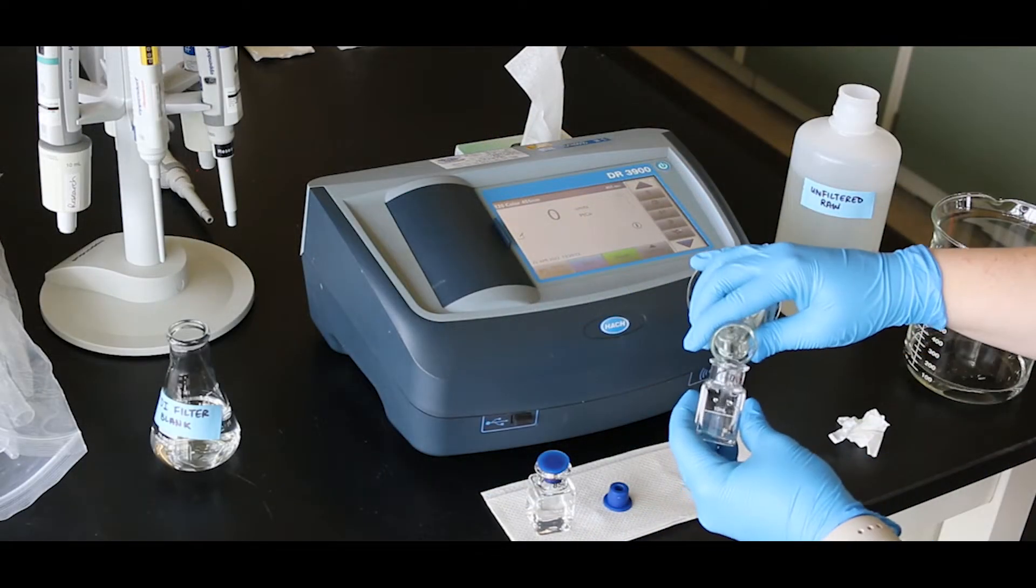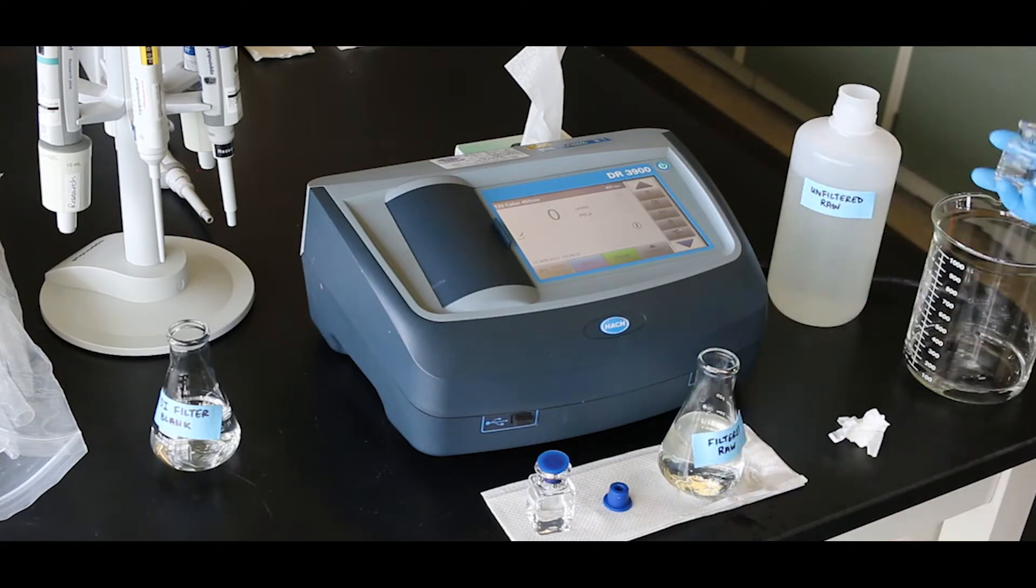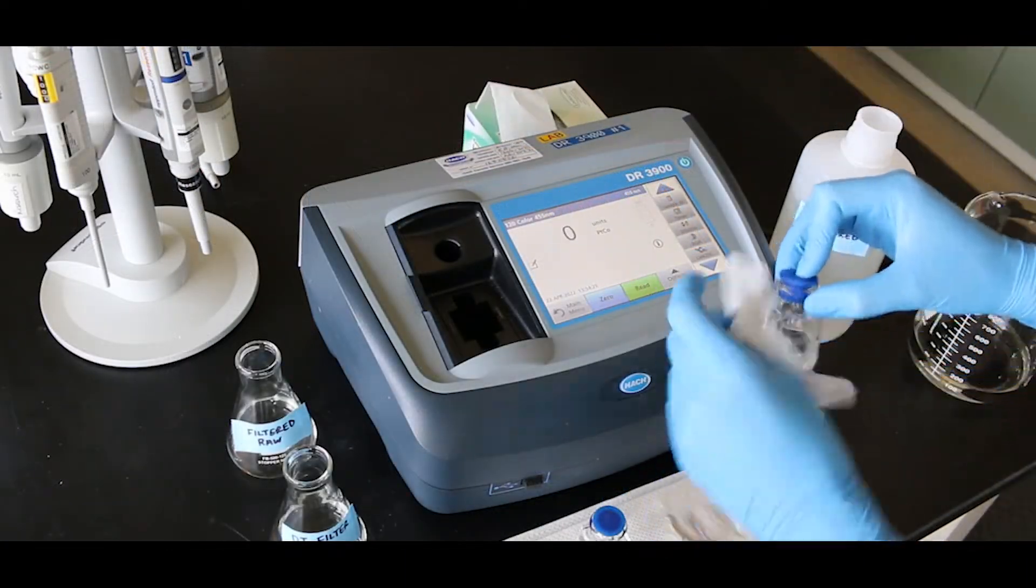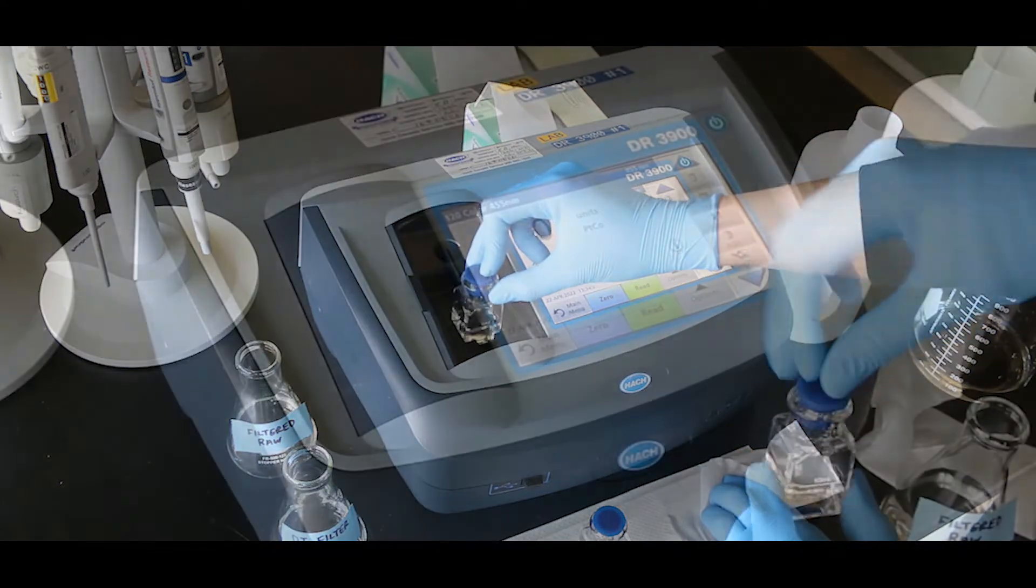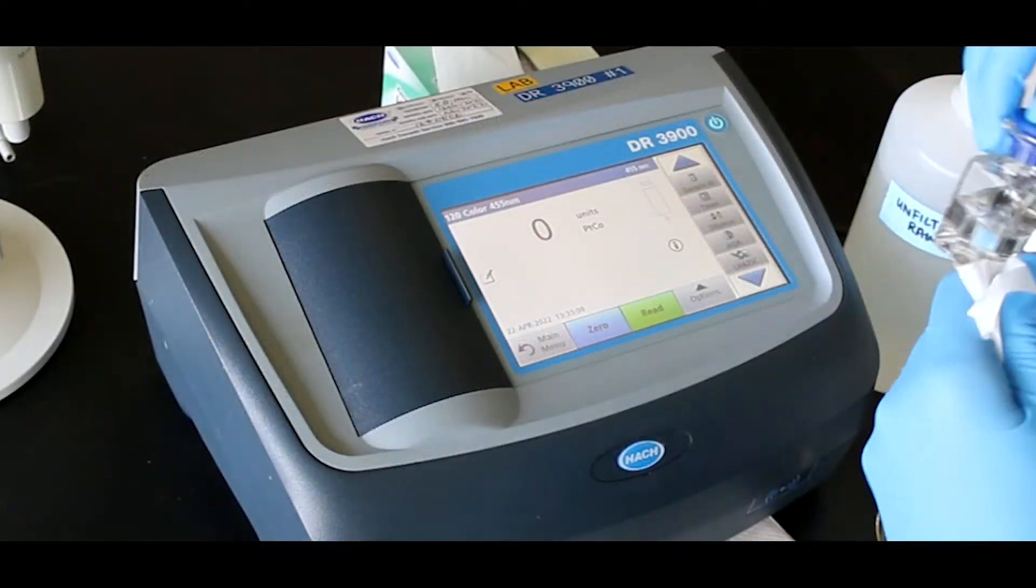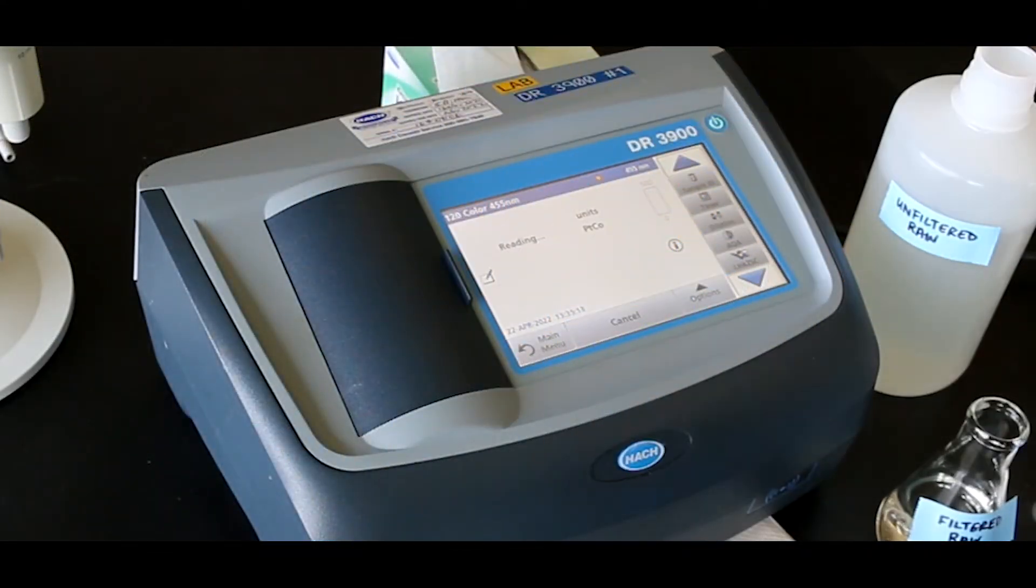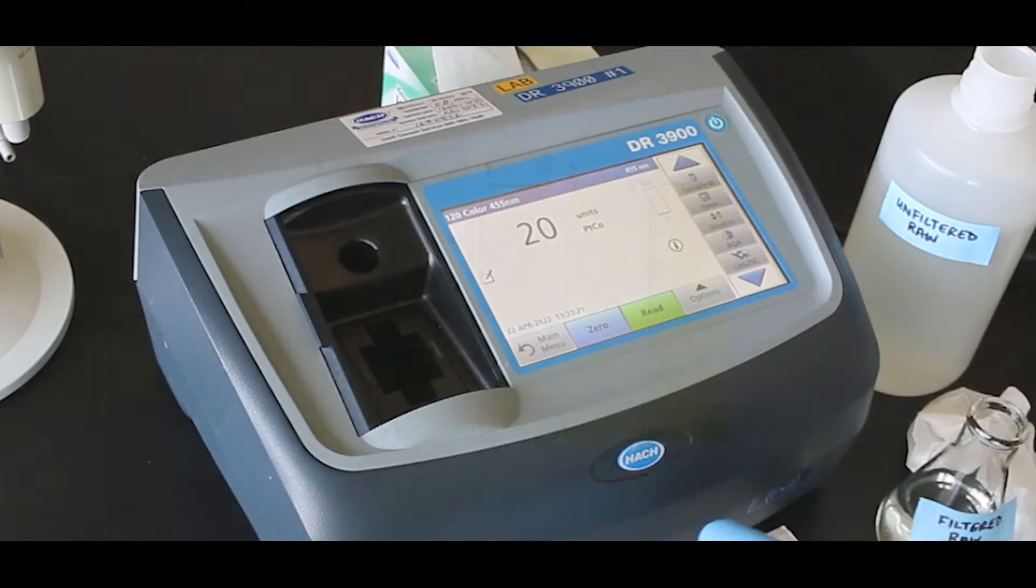Prepare the sample by rinsing and filling with the filtered water sample. Clean the outside of the sample cell and insert it into the instrument. Press read. This value will be your true color measurement. Record the results in platinum-cobalt units.